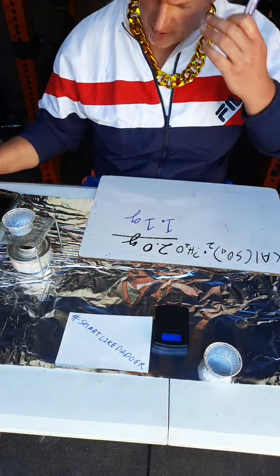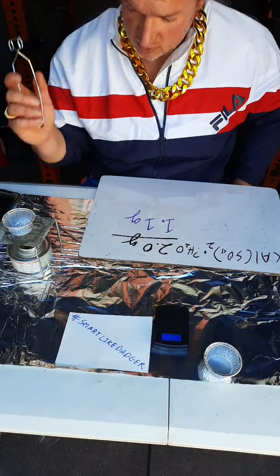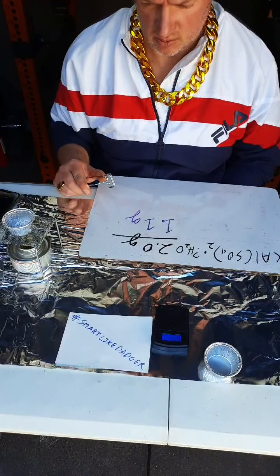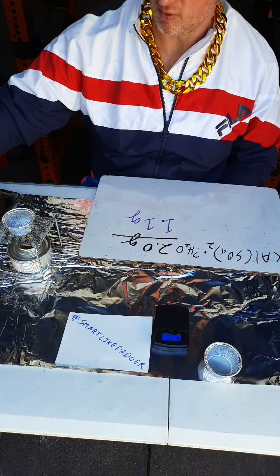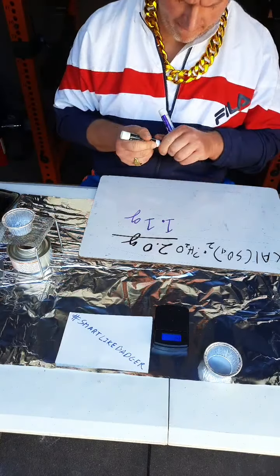One point 1 gram after the first heating. This looks like all water is gone. But to double check, you heat for another minute or two and see if the mass goes down. If it goes down a little bit, then you try a third time. But if the mass is the same after 2 heatings in a row, everything is good.